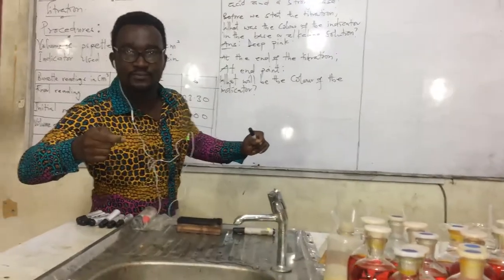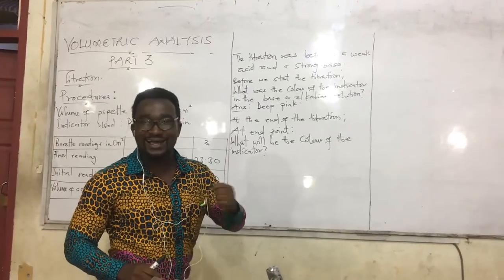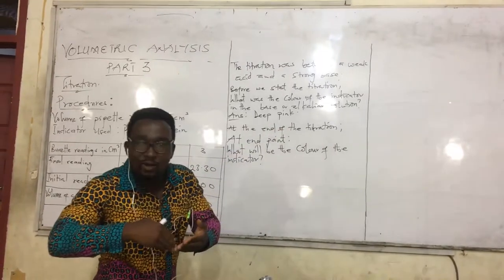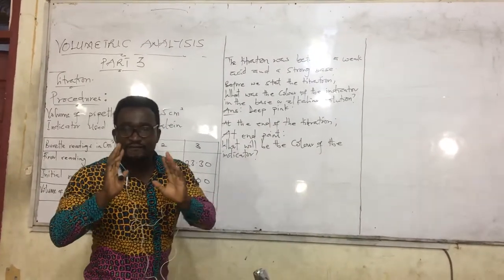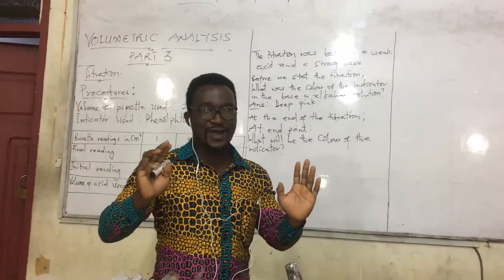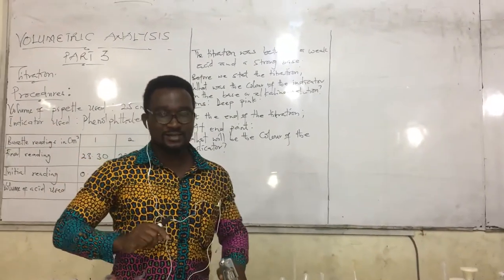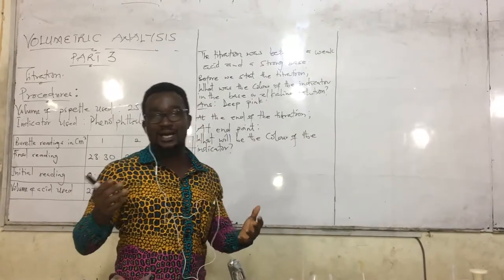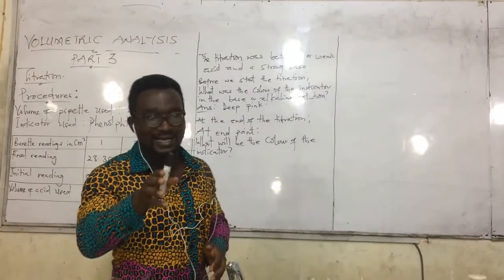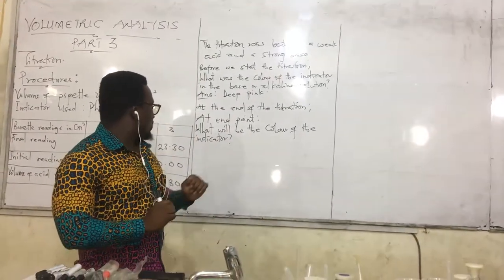If it will be basic in nature, we have already learned from the theory that the color of phenolphthalein in a basic medium or in an alkaline medium is pink. So which means the deep pink will run down to faint pink, almost approaching colorless. It is not colorless. So for my various examiners, whenever you go for the board meeting, do that rectification. It is never colorless. We always accept colorless, but it is not. When you go to precision in chemistry, that is a wrong answer. Colorless is a wrong answer. It is accurate, all right, but in precision, it is wrong.